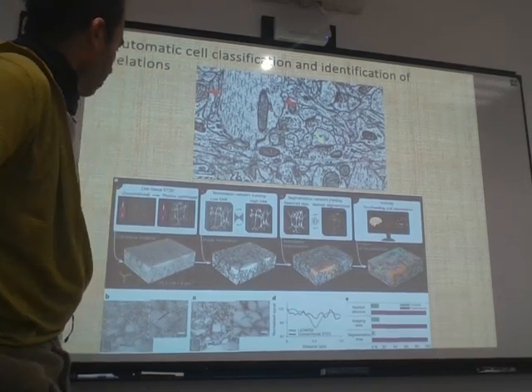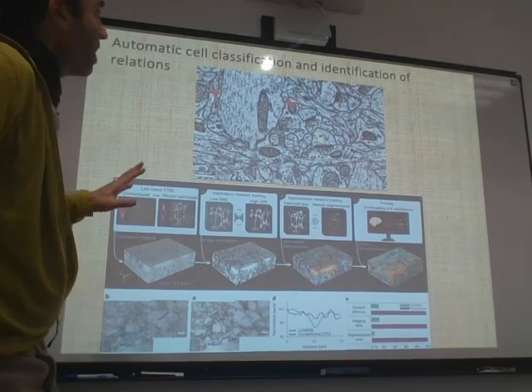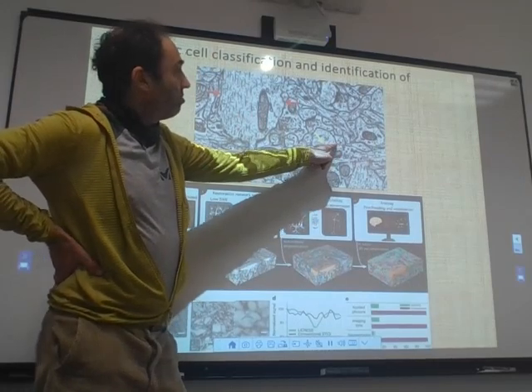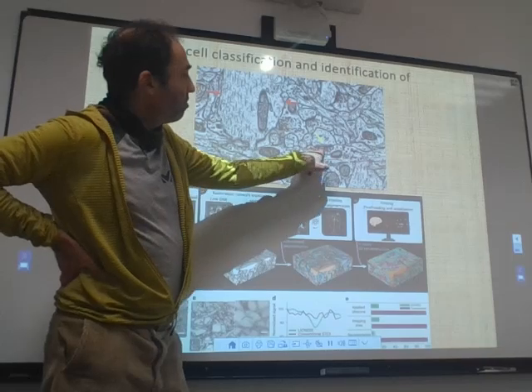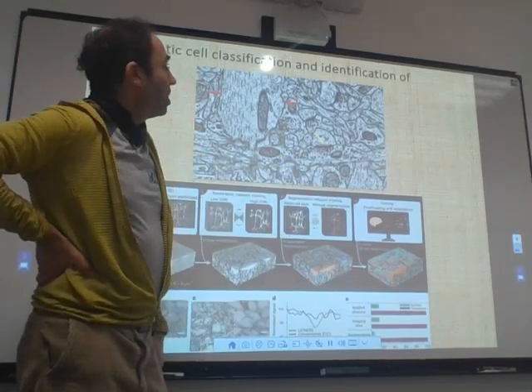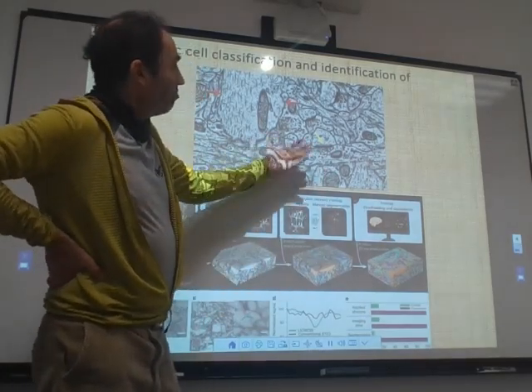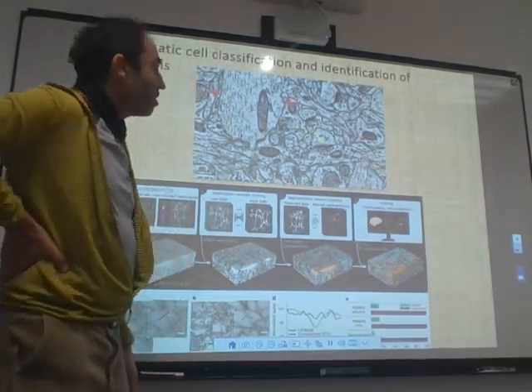Yeah, so for example, I found also this paper, which is, again, the same type of ideas. You have here, obviously, vesicles. Opposed here, you have the postsynaptic density that you can recognize. So here you have obviously a contact, and you can again move on by characterizing here the different organelles.